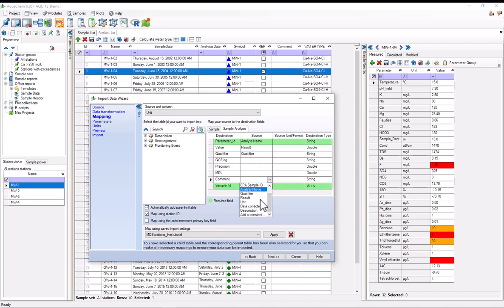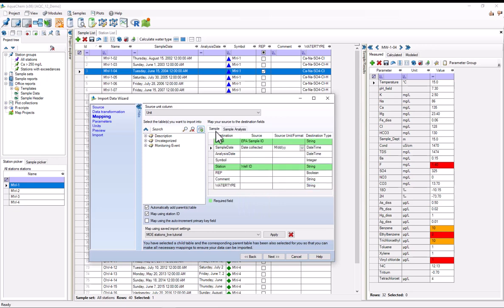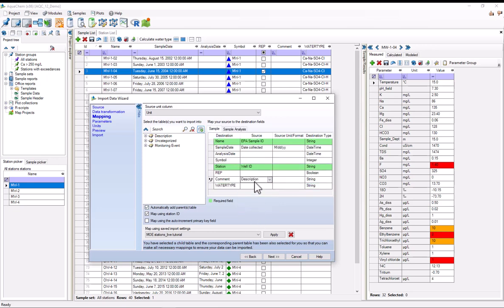And for comment, we've got a description here. Although actually, now that I think about it, I think this comment went with the samples. So I'll put this to none. And for samples, the comment, pick description here. So now I'll select next to move on to the parameter step.